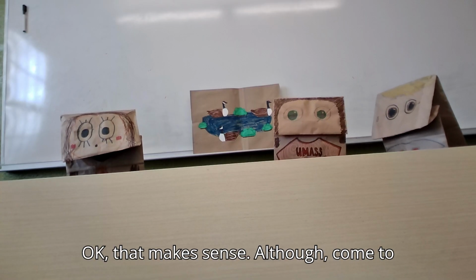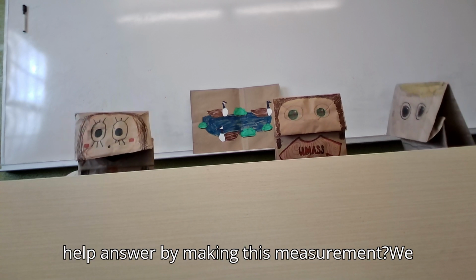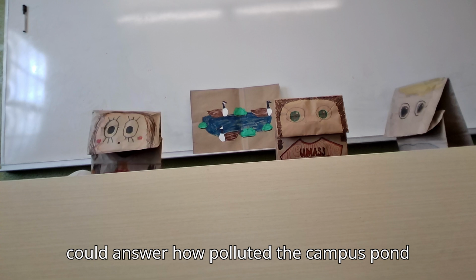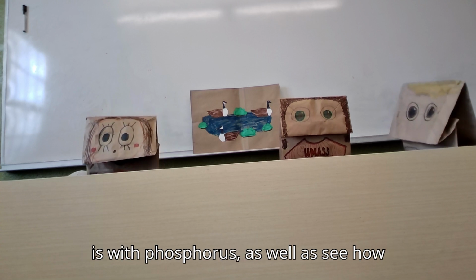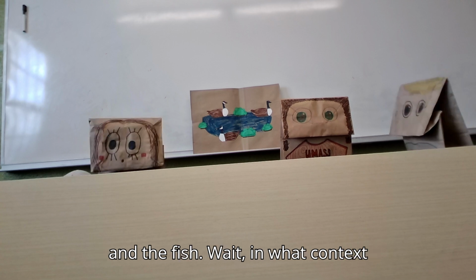Oh, okay, that makes sense. Although come to think of it, what's a question you could help answer by making this measurement? We could answer how polluted the campus pond is with phosphorus, as well as see how disrupted marine life is, such as algae and the fish.